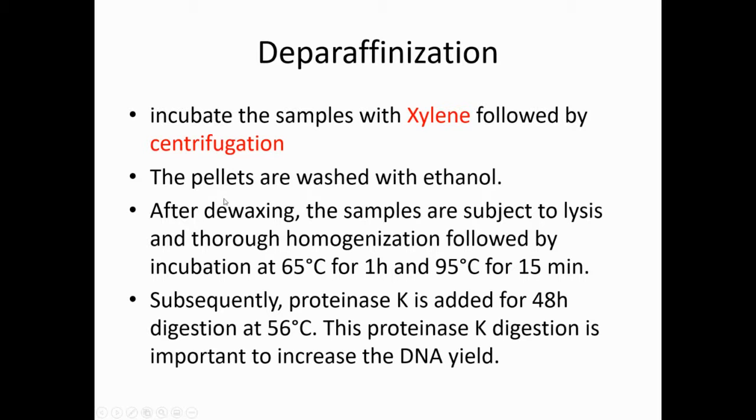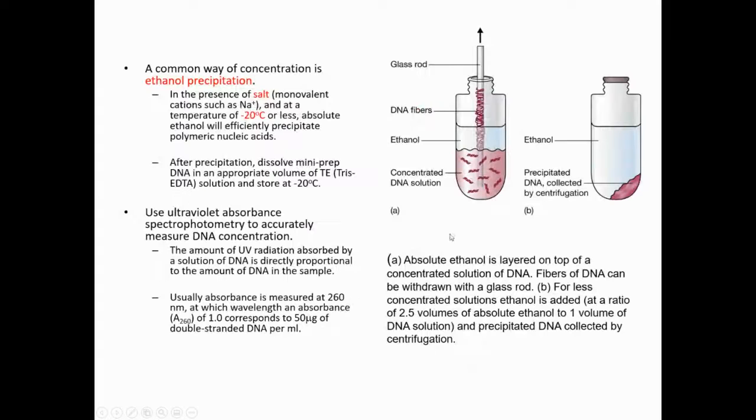So here is just to show you how to dewax. After dewax, you again lyse the cell, and after you lyse the cell, you release the DNA in the supernatant, then it is subjected to purification.